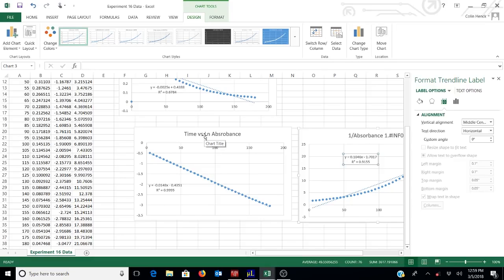All right, so now we want to look at how we find the rate order with respect to bleach. So for the dye, we did the graphs as Tim showed. He also mentioned that we found K, actually the pseudo rate constant, K prime, in this particular case. So now we want to look at how we can do it for the bleach.